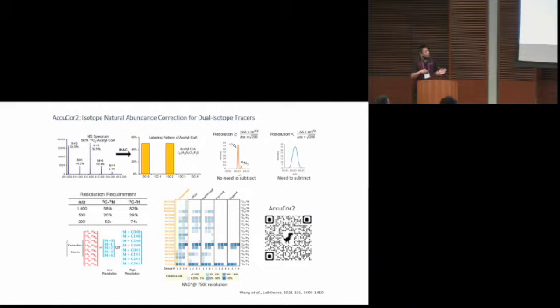We developed the tool, and we tested its performance using an NAD spectrum observed at 750K resolution. Here is the expected result, and our correction showed very good performance.